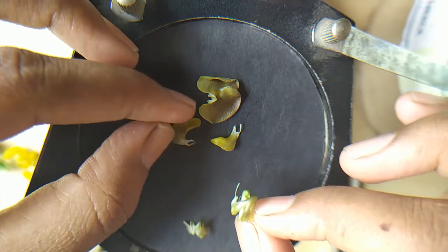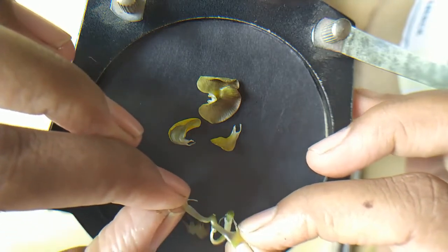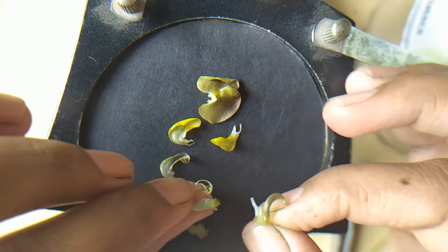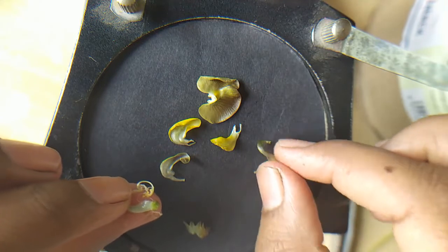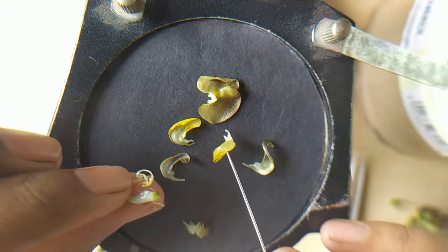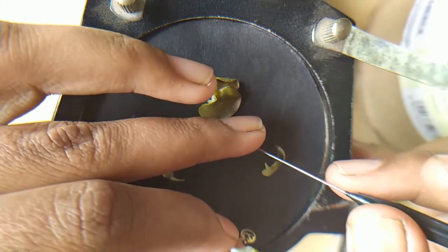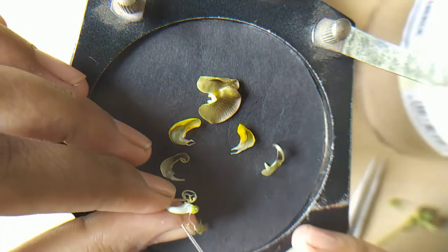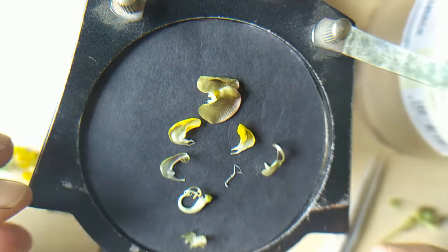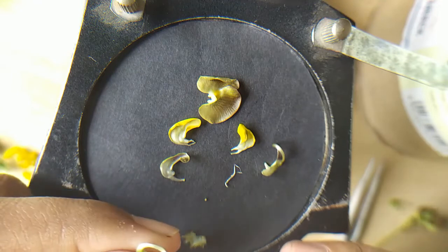Oh, so nice. The creativity of God is so nice. The mode of pollination also depends upon that. See here, because the androecium and gynoecium are enclosed in the keels, foreign pollen grains can't reach the gynoecium, which facilitates self-pollination in the case of urad bean, green gram, and groundnut. See here the very well 9+1 condition. The one anther is attached at the base, and this is the bunch of 9 anthers. And now separate out our gynoecium.